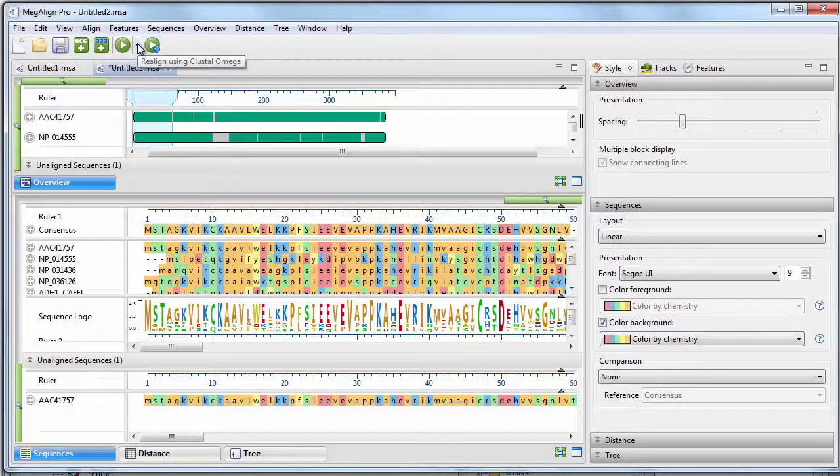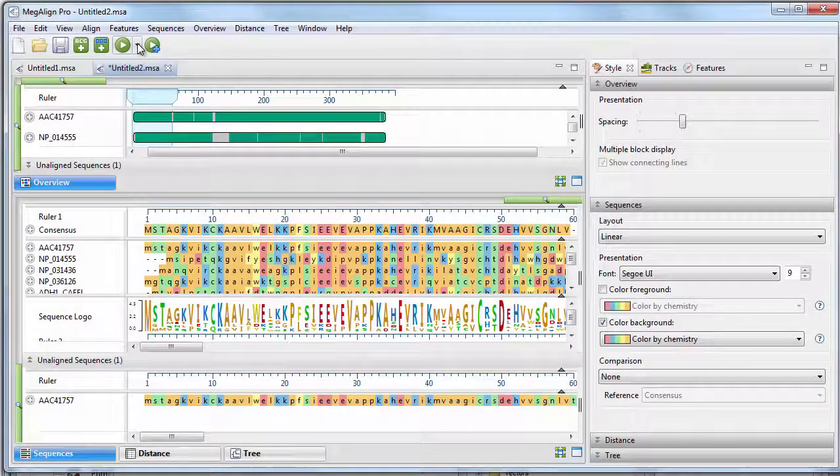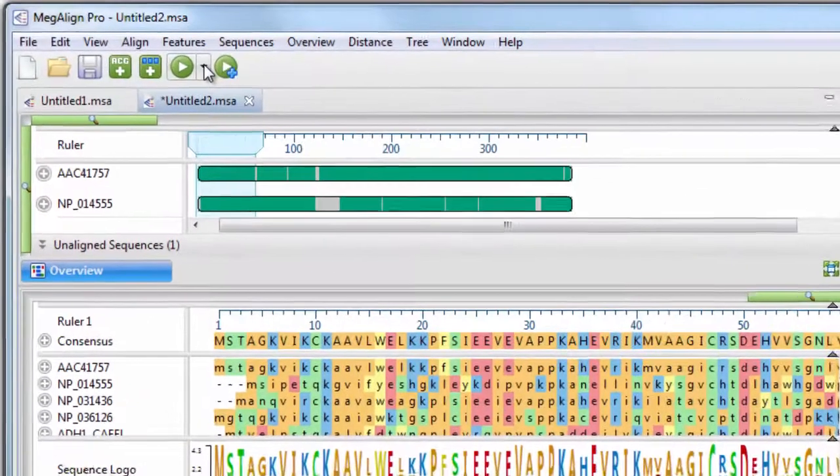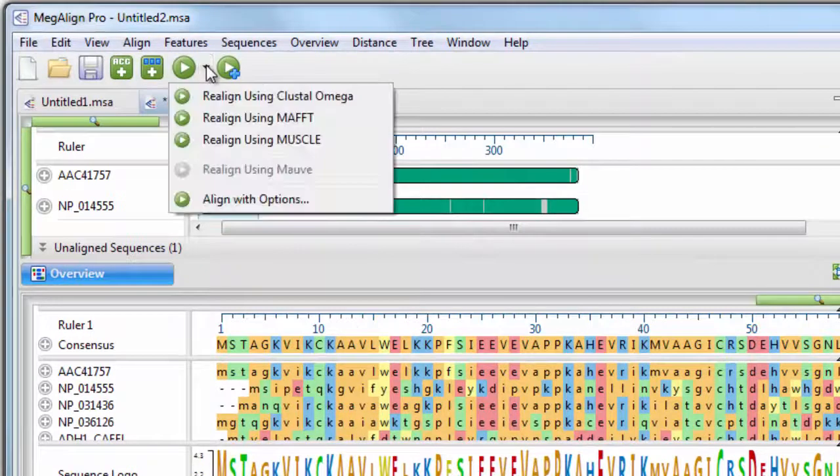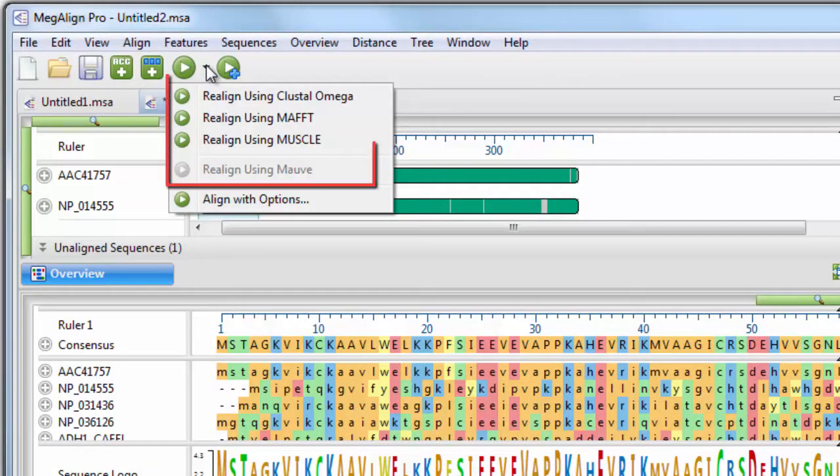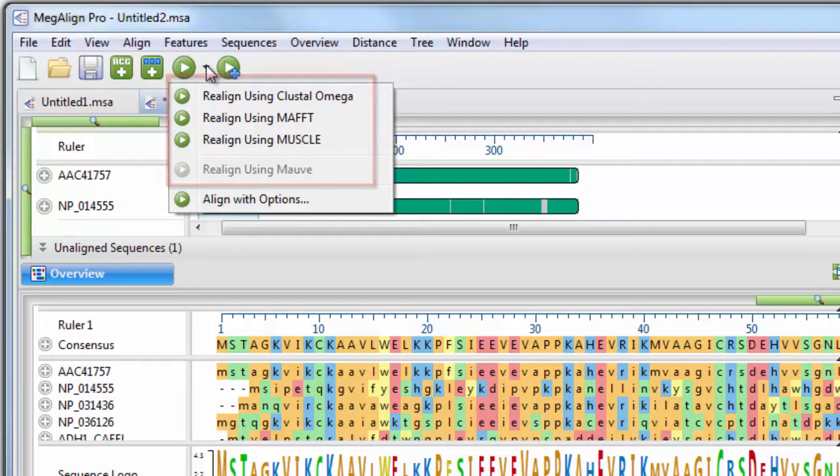This suite also allows you to perform multiple alignments of large DNA, RNA, and protein sequences using the Clustal Omega, MAFT, MOV, and Muscle algorithms.